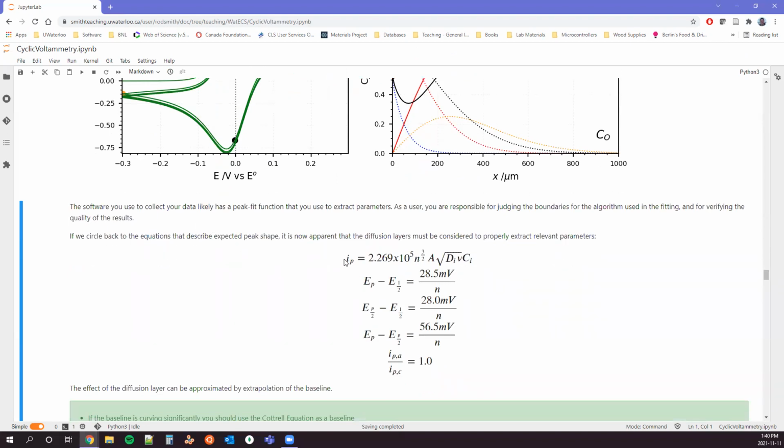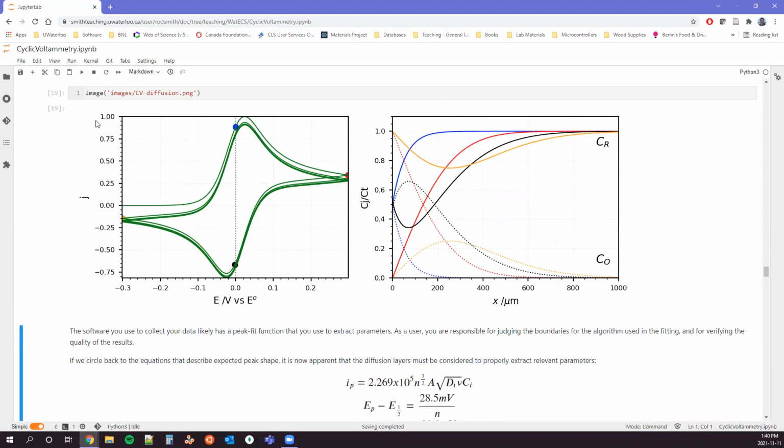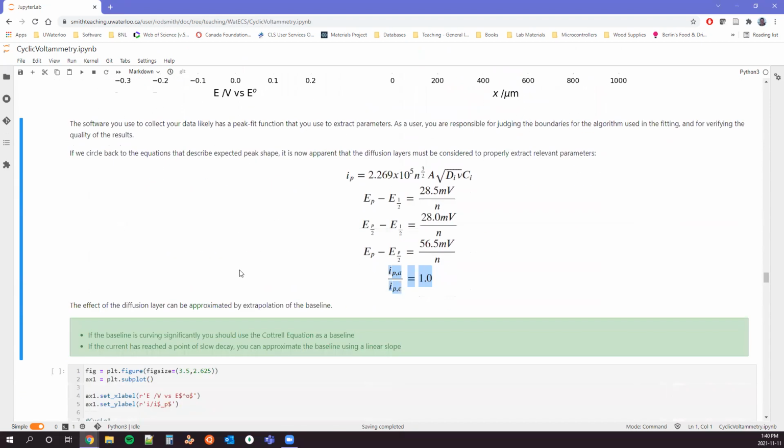And so if we circle back and think about this, we had seen the peak currents, and let's focus specifically on this i_pa over i_pc. This tells us why our i_pa over i_pc can't use these hard numbers, right? And so we can't say 1.0 divided by negative 0.8, because that's not really the height of our peak. For the height of our peak, what we have to do is consider what our baseline is.